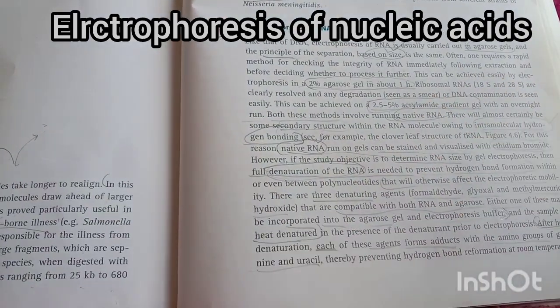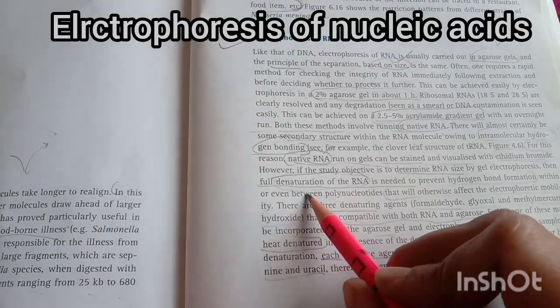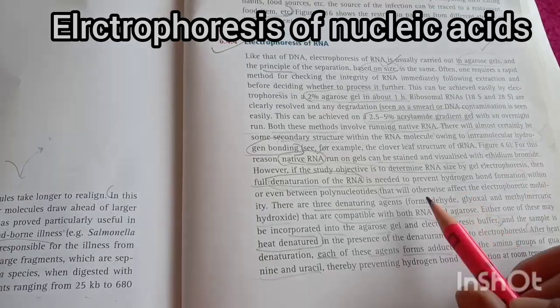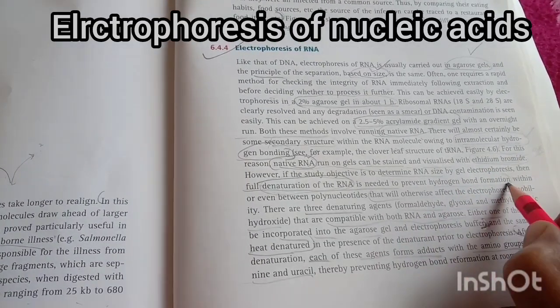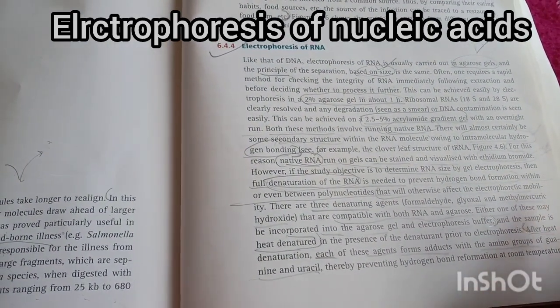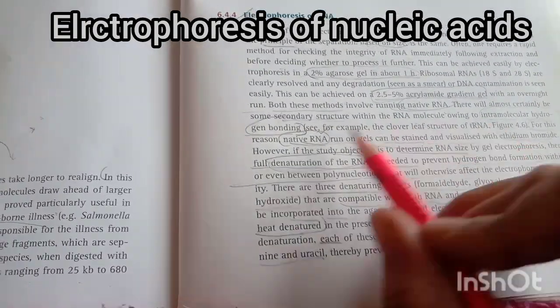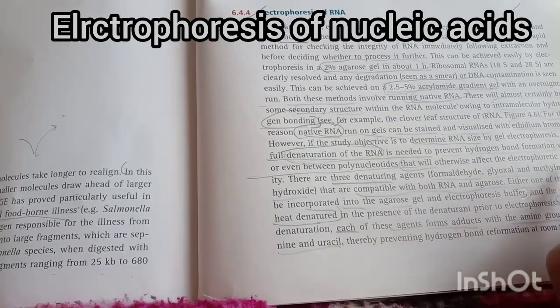We should denature the RNA to prevent hydrogen bond formation, which would otherwise affect the electrophoretic mobility, so that it cannot move easily. That is why we use denaturation, the breaking of the hydrogen bond.